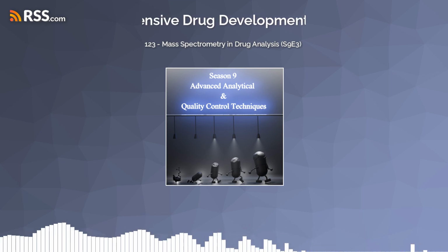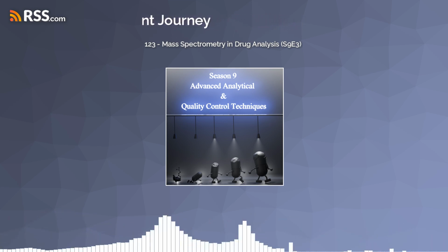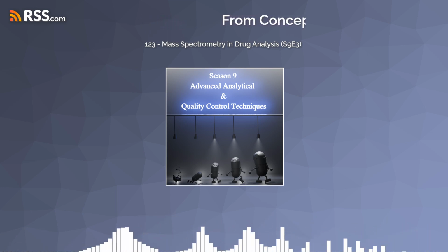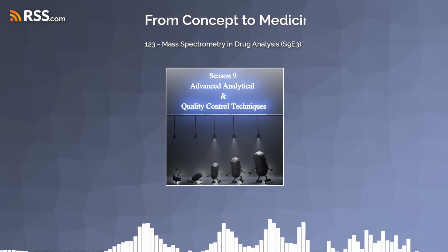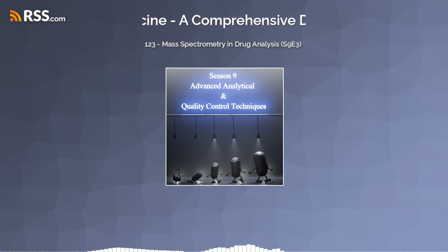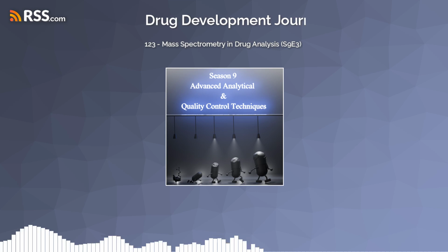How does that apply to using mass spectrometry for drug analysis? It's essential. We can't just use these fancy instruments without proving they actually work and give us reliable results. Right. Regulatory bodies like the FDA have really strict guidelines for validating methods in the pharmaceutical industry. So it's not enough to just have the best tech. You've got to prove it consistently delivers accurate results.